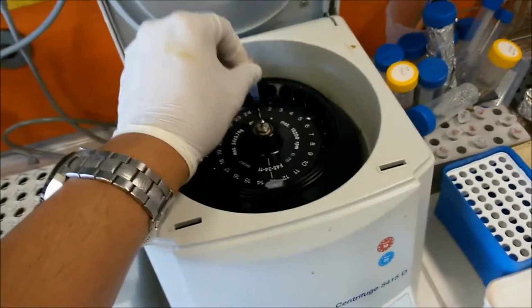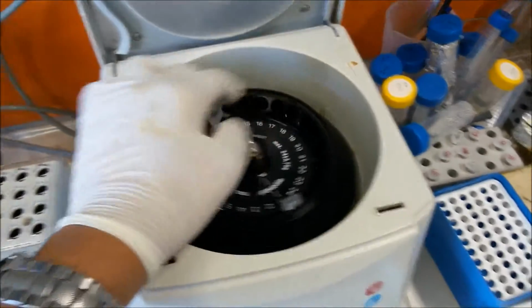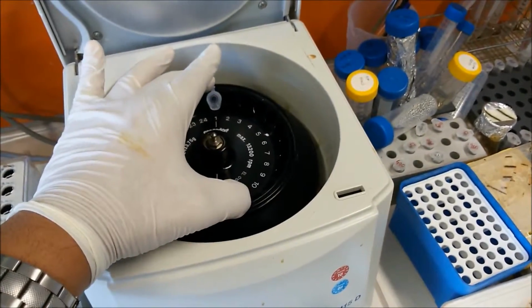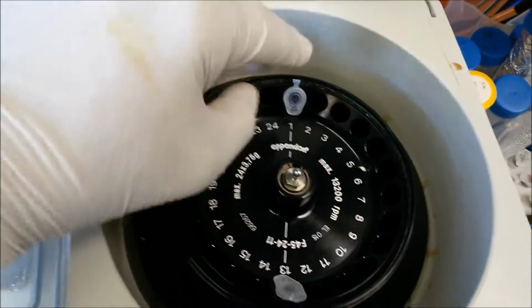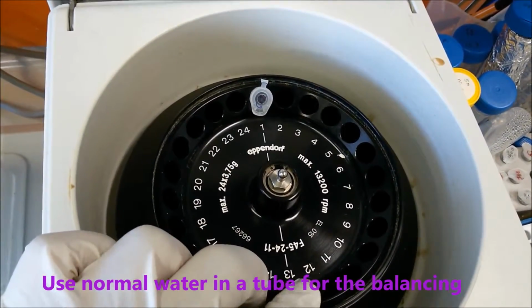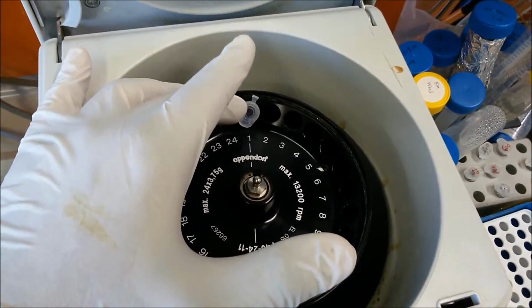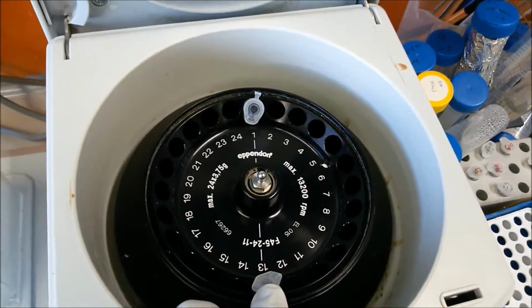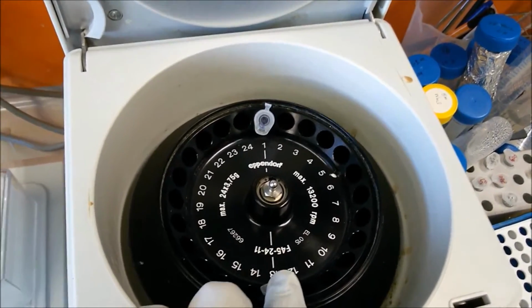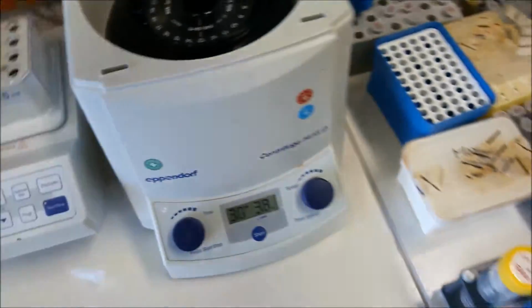What is a very important feature for the centrifuges is that because they are a rotating machine, they should be very much balanced. So if you put one tube here, you have to put the same volume, same weight actually, so the weight should be balanced. So let's say if this tube weighs 2 grams, you have to put a balance in front of it of the same weight of 2 grams. Okay, so that's one very important thing here that I want to tell.